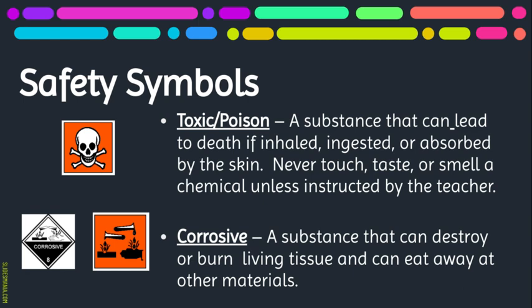There are lots of chemicals that look like water that when you smell it could burn the inside lining of your nose or cause you great harm and have you go to the hospital because you smelled or because you drank it. So please don't assume that it's not toxic. Please assume it is unless the teacher tells you otherwise. It's always better to be careful than not careful.